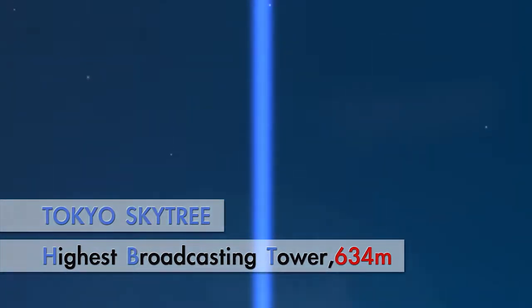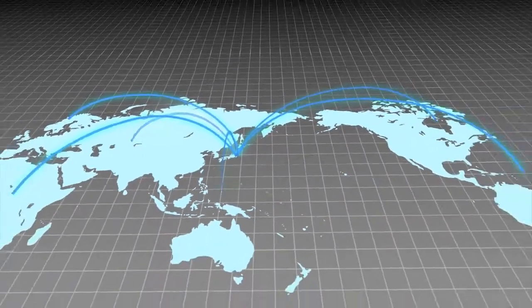Our global network has grown to over 40 technically trained distributors, each furnishing prompt and extensive support to maximize instrument operation.